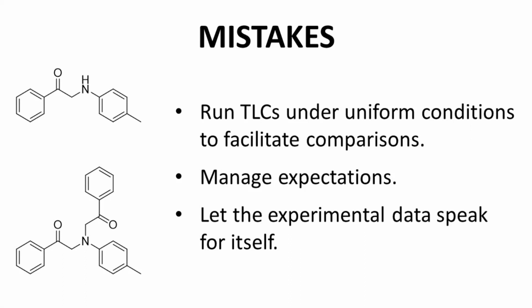Looking back, how could I have prevented my confusion that I encountered in this reaction? First, I could have performed both TLCs under carefully matched conditions. No using a mobile phase that was prepared well over an hour ago. If the TLCs were better matched, I could have quickly checked the Rf values and avoided the idea that the impurity was para-toluidine. Second, I should have been less convinced with my expectation that para-toluidine was the impurity.